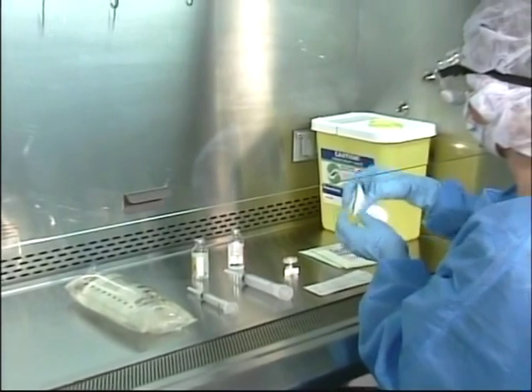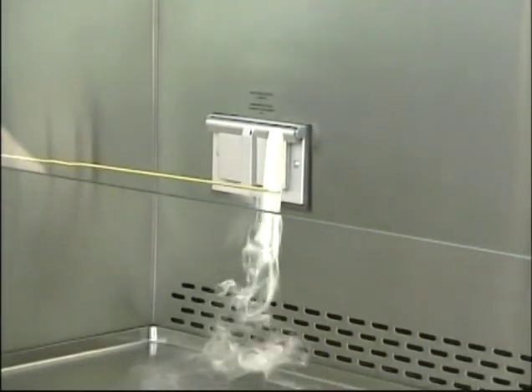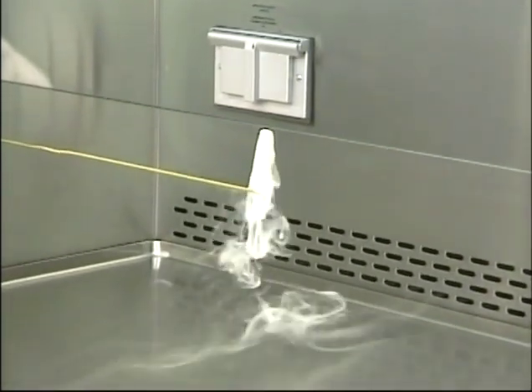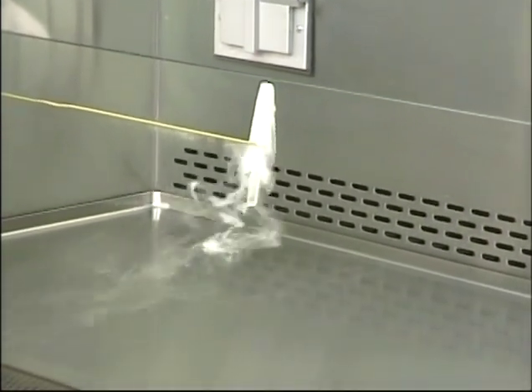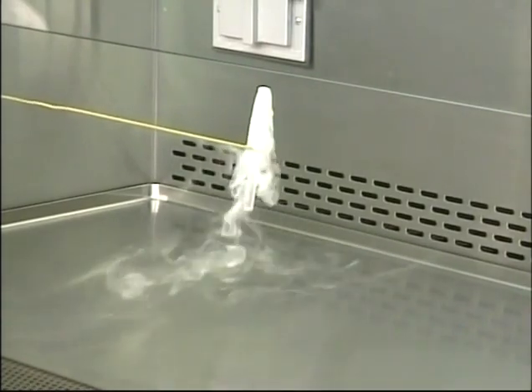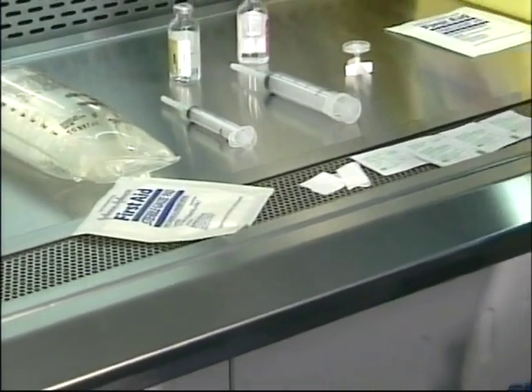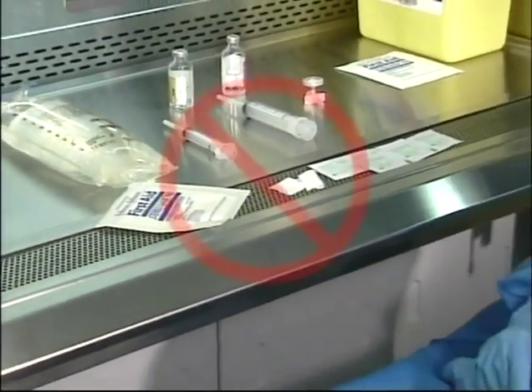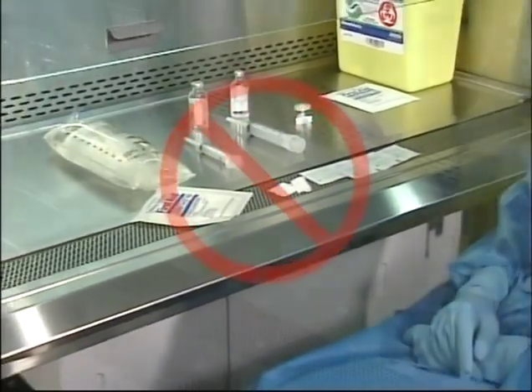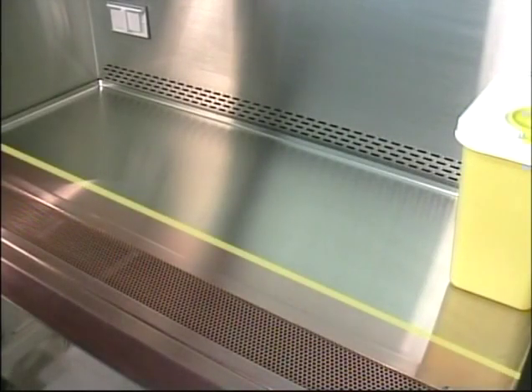manipulations. Remember also that the supply air splits as it approaches the work surface at a location known as the smoke split. A zone of confusion exists in this area, and no critical sites or pathways should be located directly within this zone. Also, under no circumstances should any objects be placed on either air return grill, and no operations should be conducted within 3 inches of the front grill.